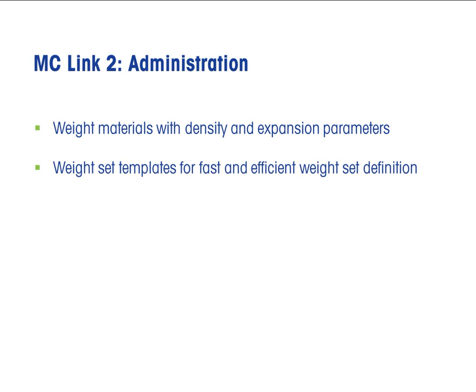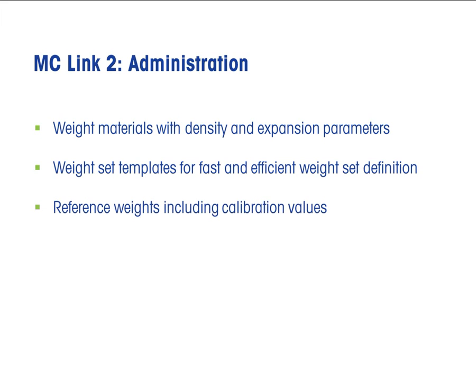To generate weight sets efficiently, the main structures are defined and saved as a template. Reference weights are defined with weight set templates and completed by entering data from the calibration certificate.